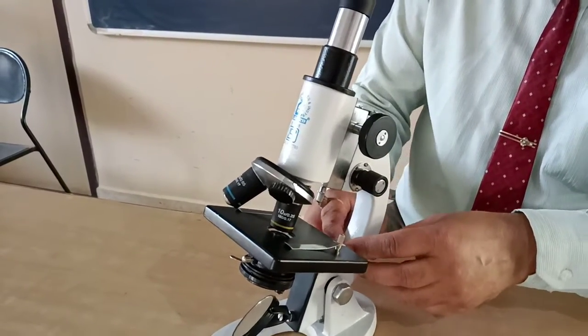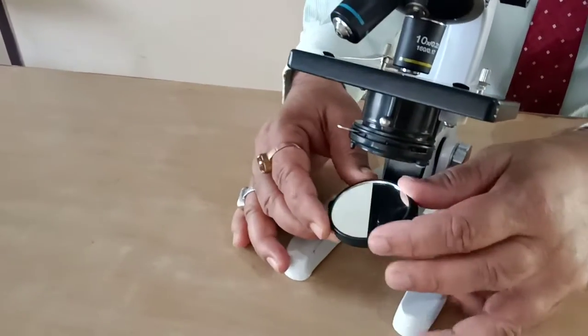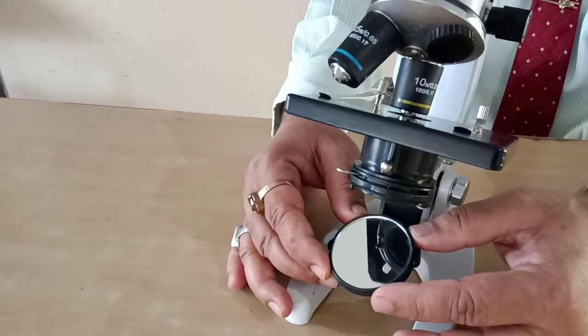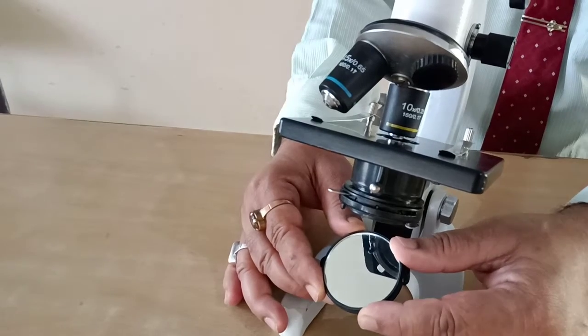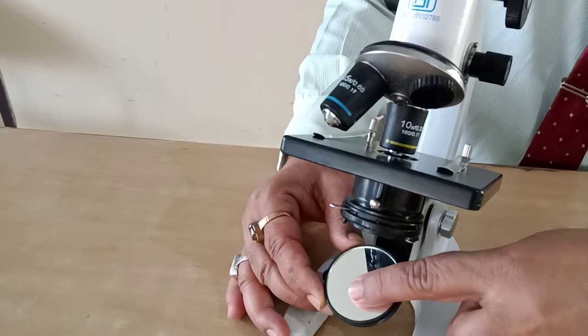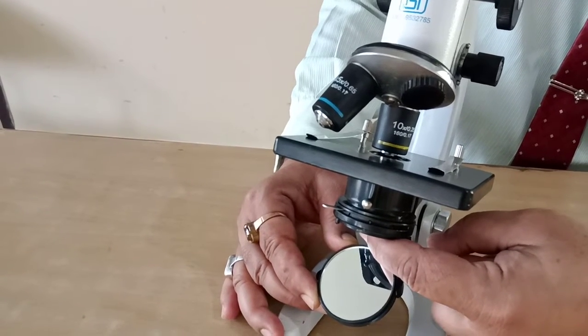Now let me come to the mirror. This is the concave plane mirror. Again, same mirror as we have discussed in simple microscope. The function of the mirror is that it reflects light. Light is coming this way, so light will be reflected this way by this mirror through the diaphragm.